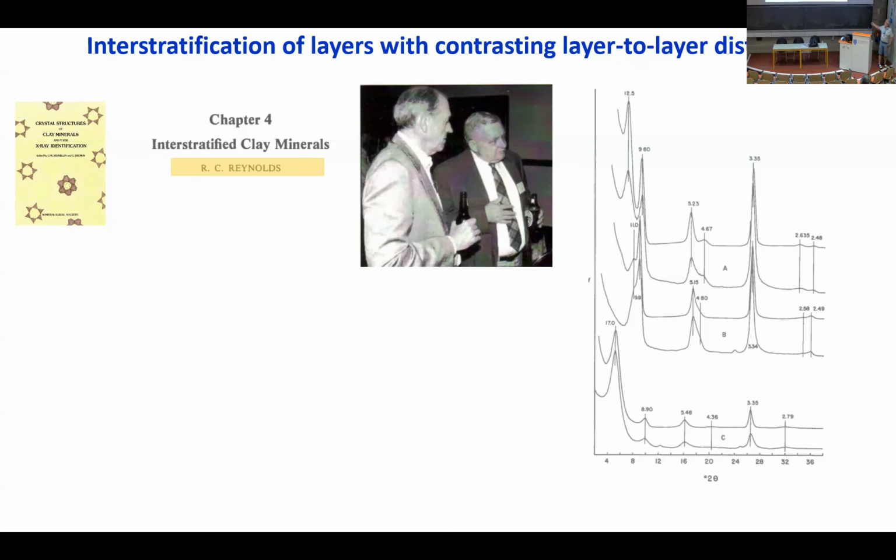They could just say that I have, whatever, probably a periodic series, a 50-50 interstratification of smectite with 2 planes of interlayer molecules and mica, and that's it, and show no comparison.